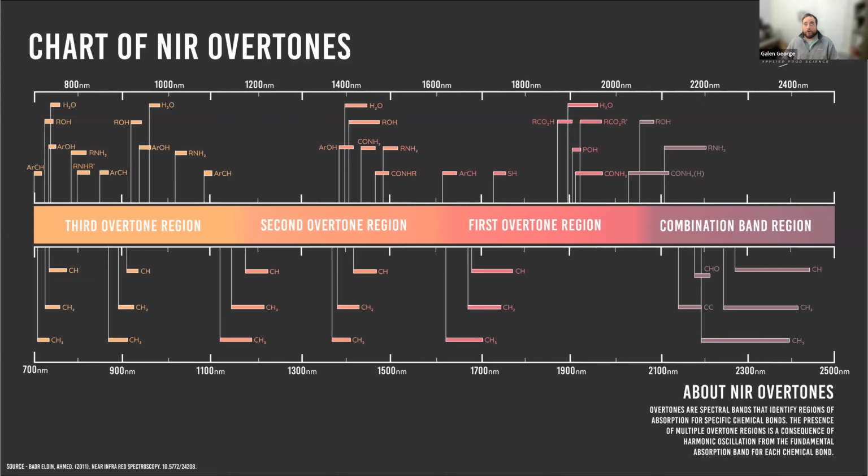So PCA is kind of the original chemometric method. What it's used for mostly is reducing the dimensionality of data, and also looking for relationships, looking for these kind of discriminant data sets where in a larger data set, we can see whether there is a difference between this unrotted fruit and this fruit that is rotted. But it's not ever really used on its own as a model building technique. It's more used as a precursor to then performing one of these other methodologies.